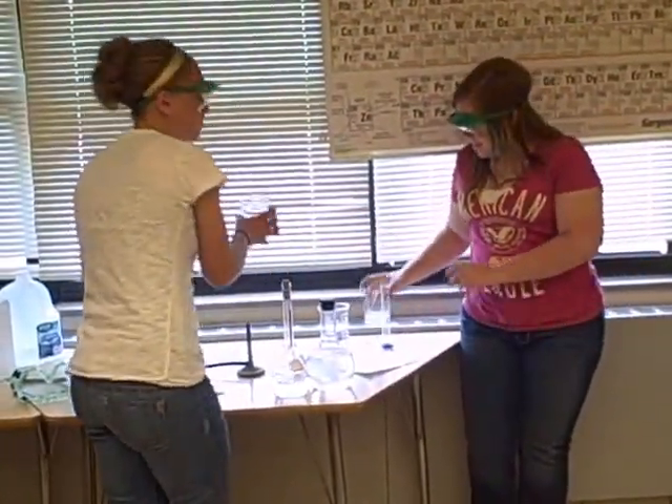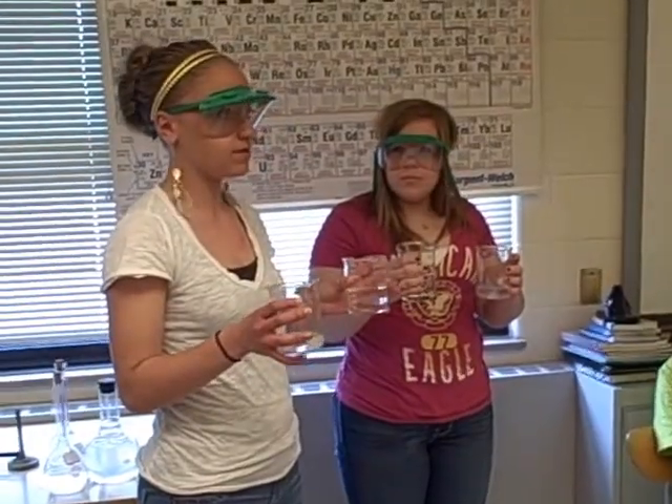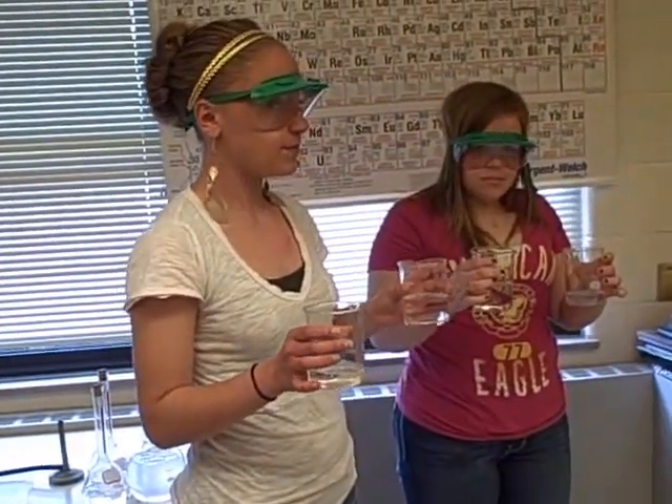Don't blink, this one is pretty fast. We have two different solutions with two different amounts of the certain solutions. Hopefully that means that there will be reactions at different times, but don't blink.